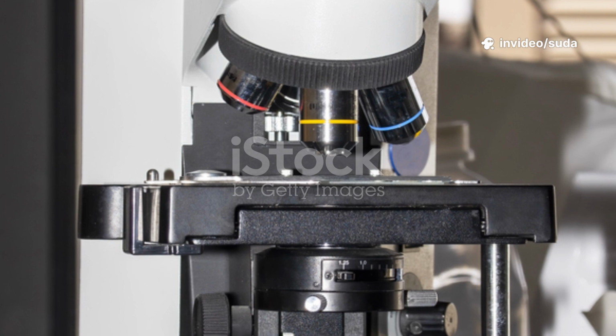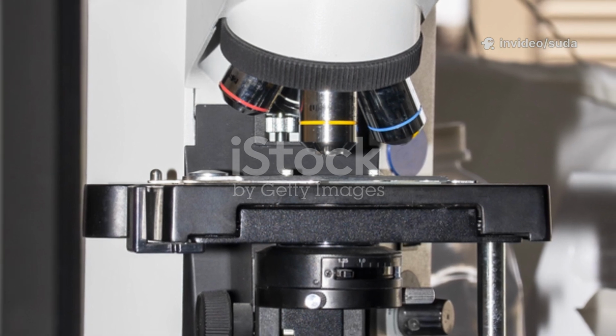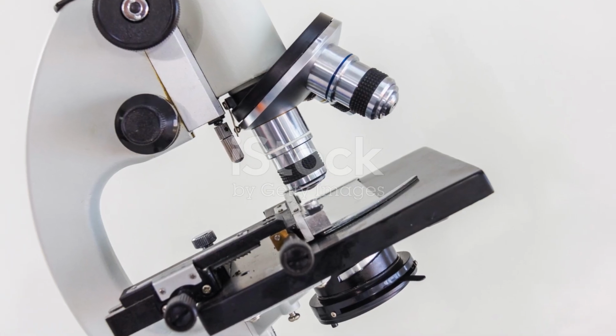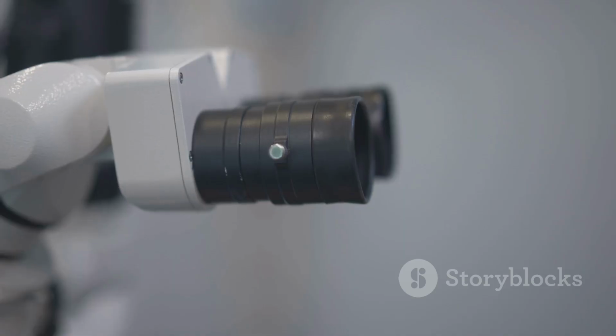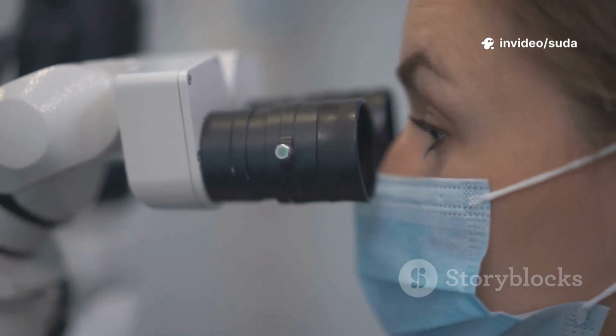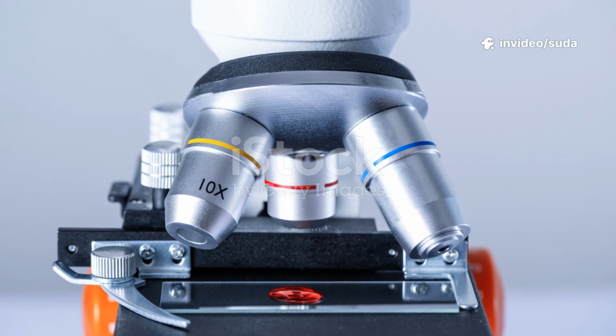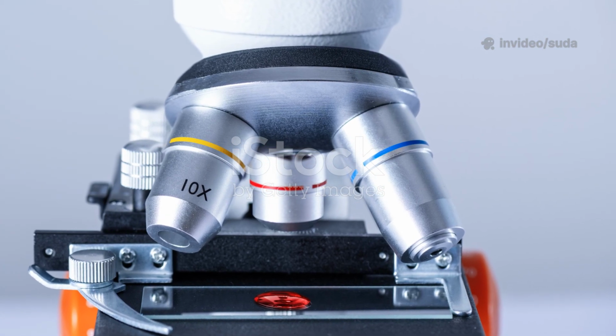Have you ever wondered what's happening in a single drop of water? A whole world is swirling in there. It is a universe too small for our eyes to see. But we have a special tool that lets us visit. It's called a microscope. Microscopes are like magic windows. They take tiny invisible things and make them big and clear.